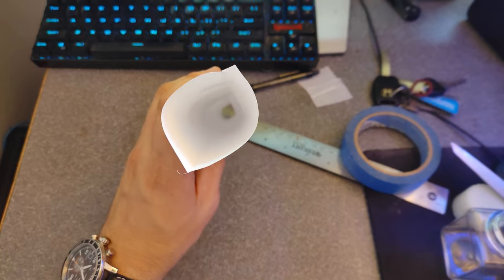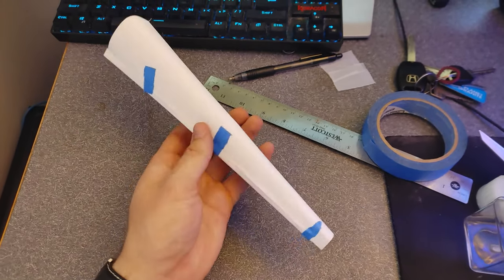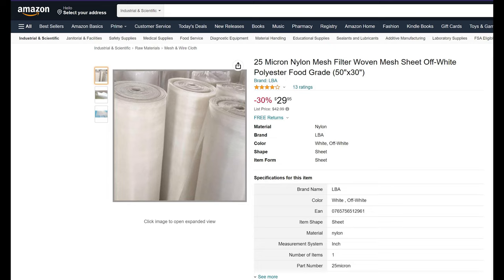The first thing I did was make a paper model of the plankton net so I could get all the dimensions figured out. The net itself is made of woven nylon. I decided to go with 25 micron because I think that's going to capture a pretty good range of plankton. It's going to miss some of the really small nanoplankton, but those aren't going to be very interesting under the microscope anyway.